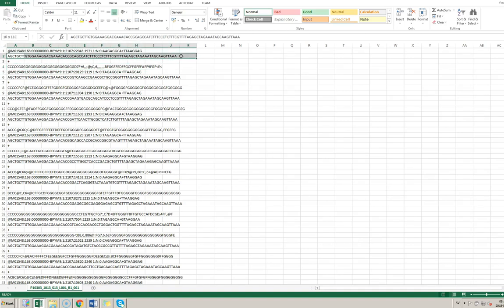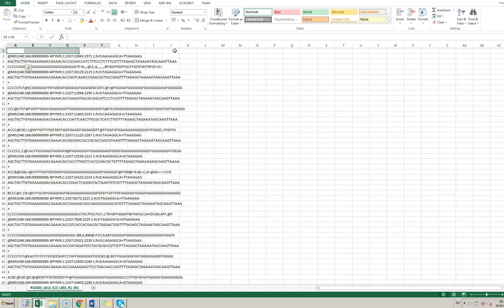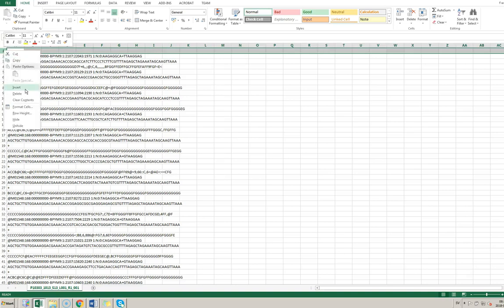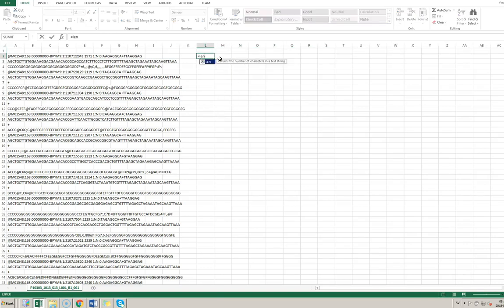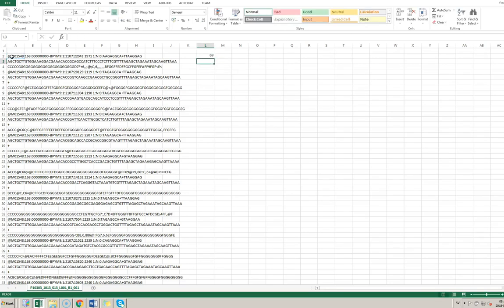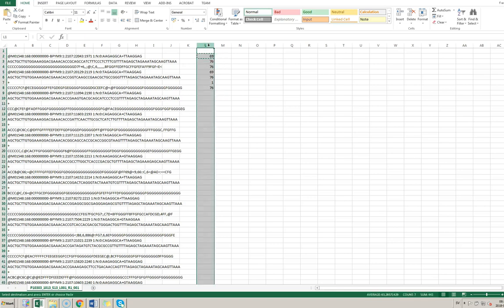Start by moving things down to get the top row empty so I can use it for sorting later — normally we'd just insert a row but this file is completely full. Then I'm going to use the LEN command, which returns the number of characters in a text string. You'll see the actual sequence we're interested in is 76 characters, and the quality information is also 76, so we can't use length alone to filter things out.